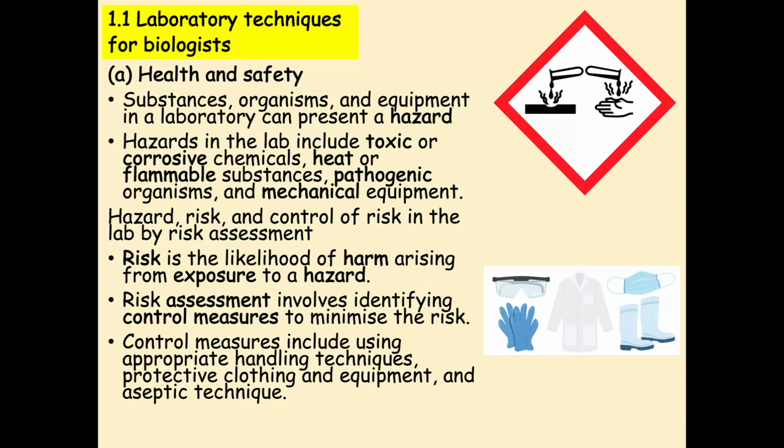So for example, if you are working with deionized water, the risk is relatively low because if you're exposed to that water, it's not going to be as bad for you as if you were exposed to hydrochloric acid or nitric acid or something else like that, something nasty. So you have to be conscious of the risk when you're doing various things. Similarly, in the biological field, if you're working with live organisms, there's obviously a degree of risk there. Bigger organisms obviously have the risk of becoming physically involved with you, whereas pathogenic organisms have the risk of infecting you, via your respiratory pathway or something similar. So we have to always be conscious of that.